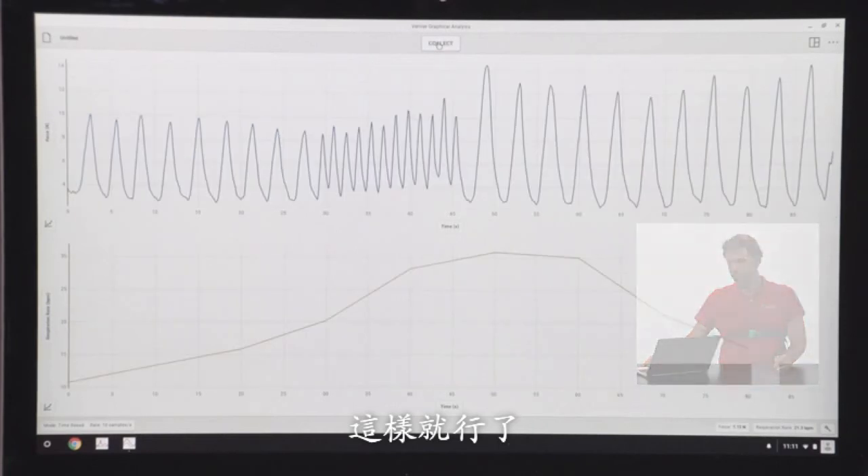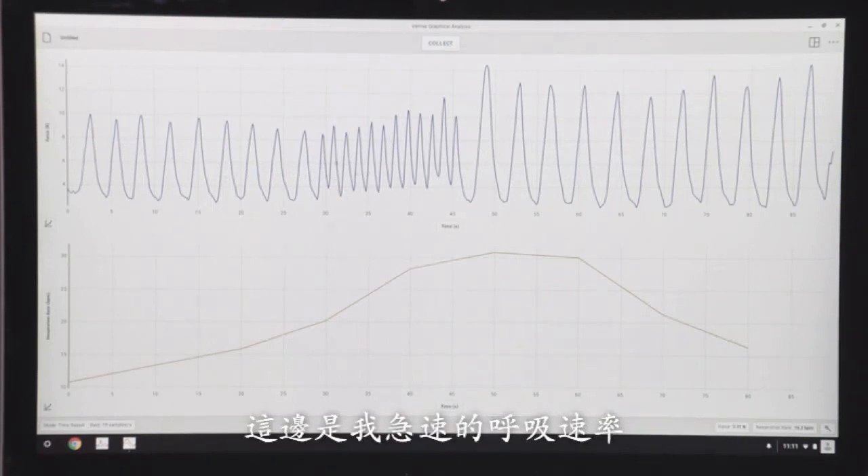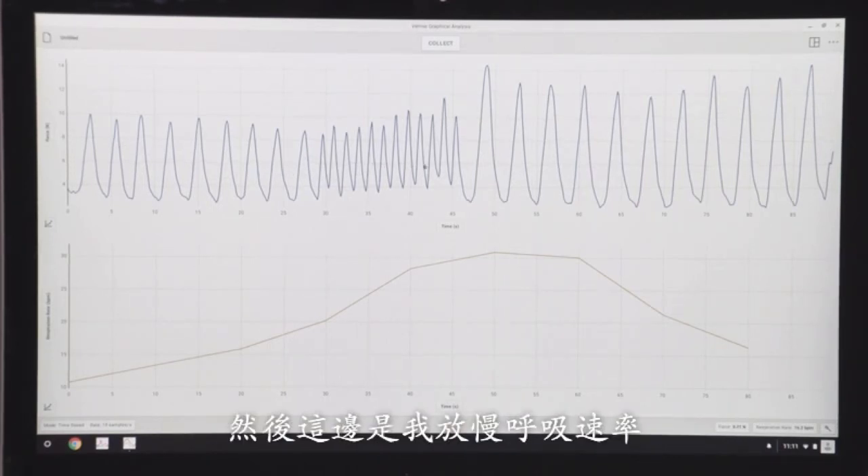I think that's good. Now what you should be able to see up here is my respiration effort. Here's a series of normal breaths, then a series where I'm breathing rapidly, and then a series where I slow down my respiration rate.